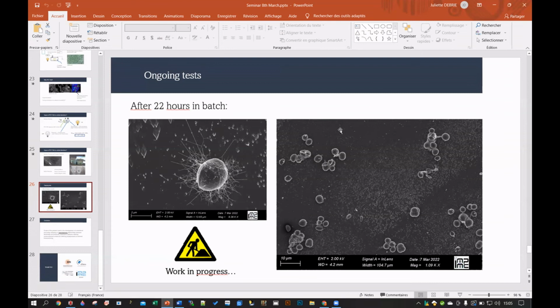What kind of controls are you using for the biotic settings? For instance, do you know how much the pH increases without the calcite chip? If I understood correctly, this is from the setup where you have your calcite with the microbes in the growth media. Is there another control where you know how the pH increases when the cells are just growing in that particular growth media recipe? No, we didn't do that yet, but I think it could be useful to know.